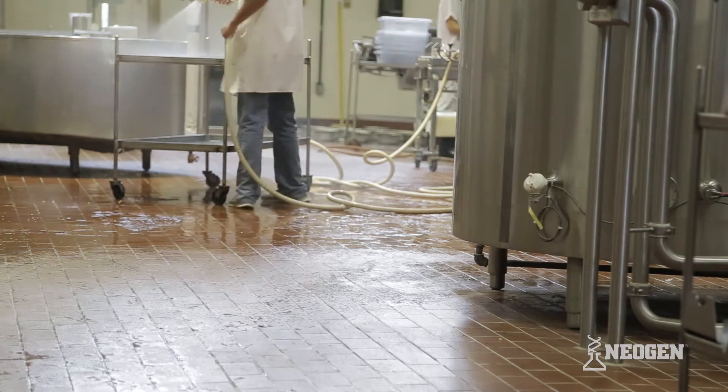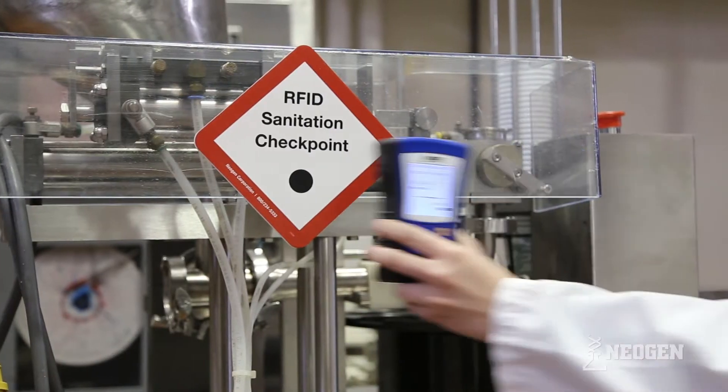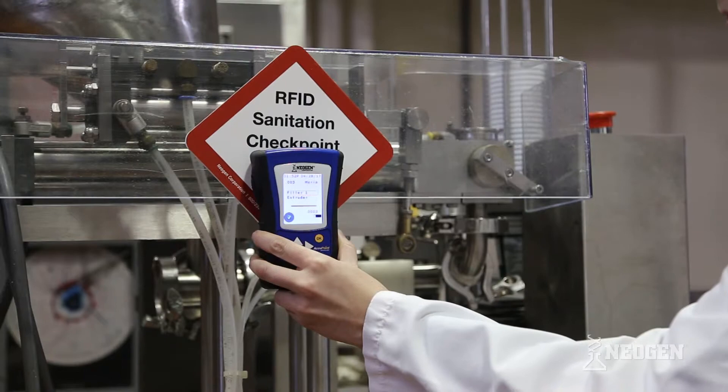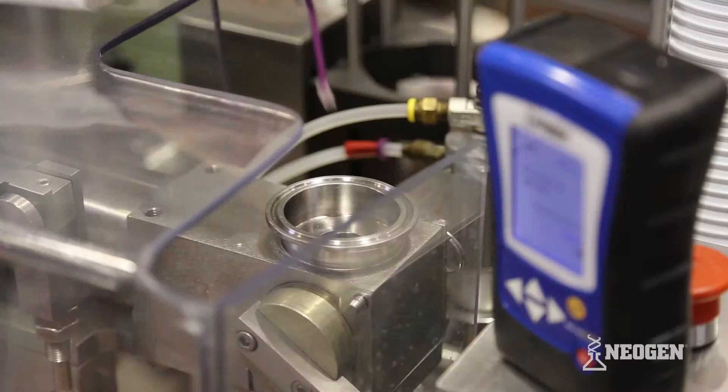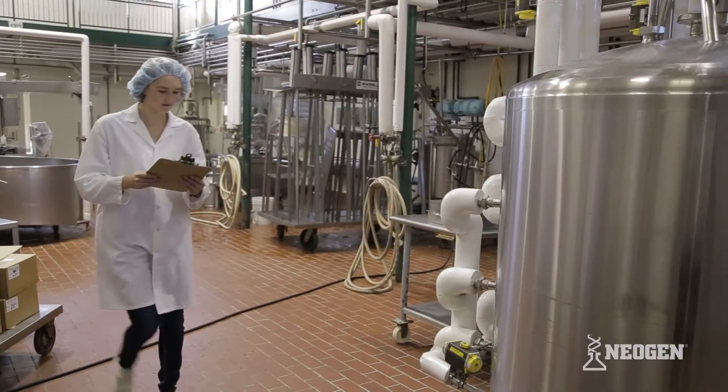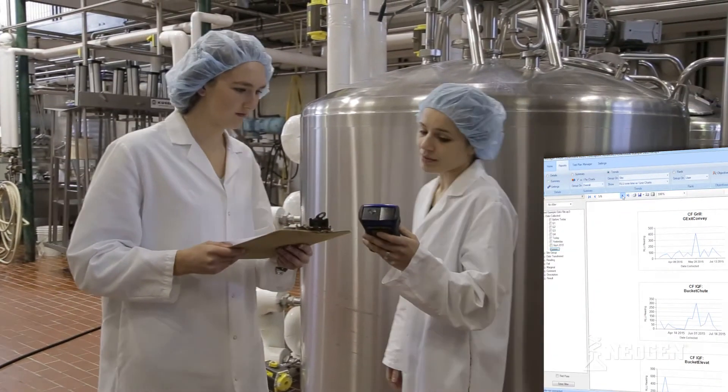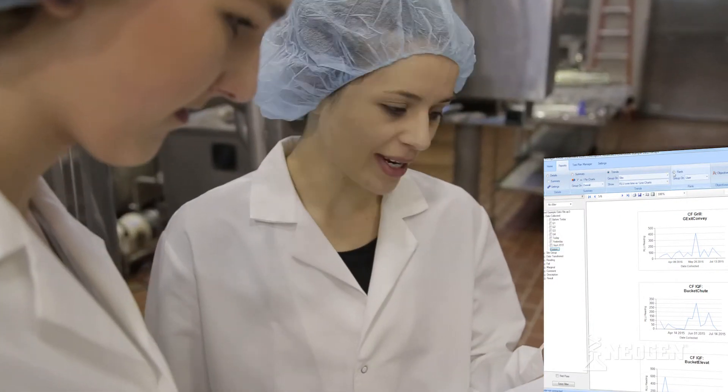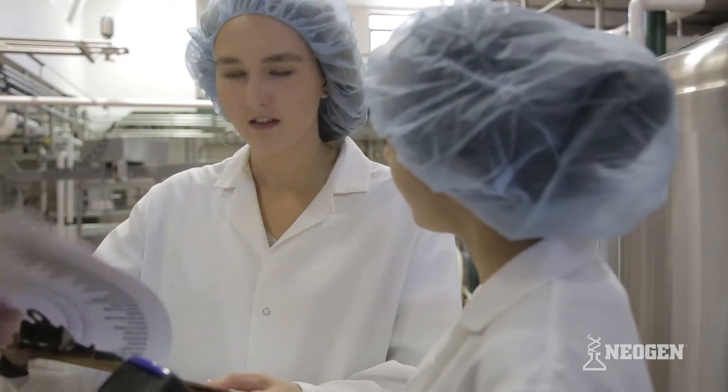Hygiene monitoring is even easier when you use the Accupoint Advanced System with optional Radio Frequency Identification, or RFID, technology. Coupled with Accupoint's enhanced data manager software, the system saves facilities resources that otherwise would be devoted to developing complex and time-consuming test plans.